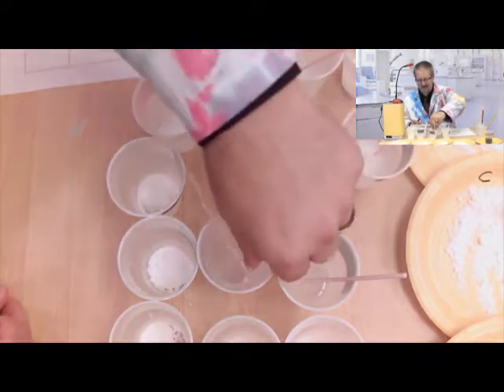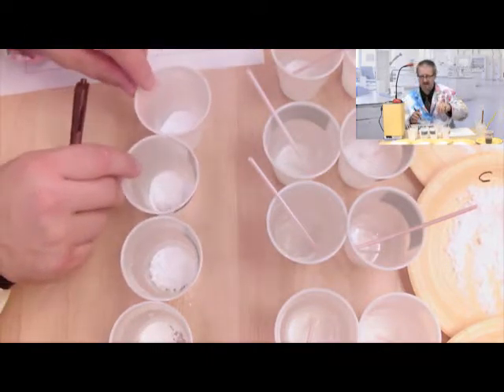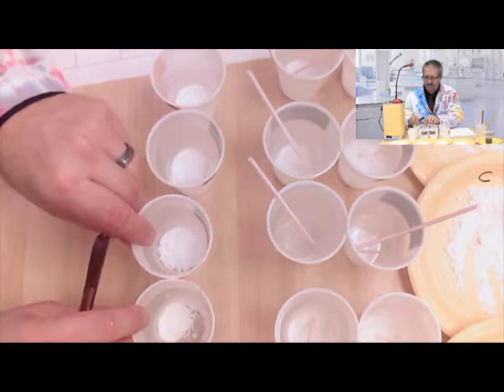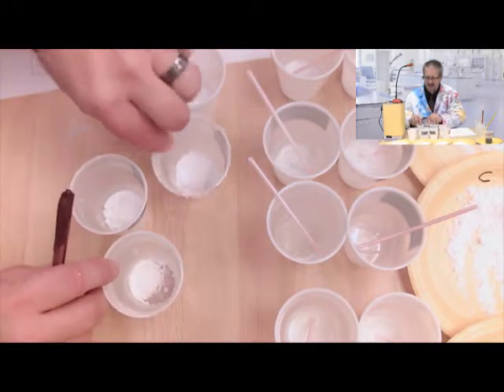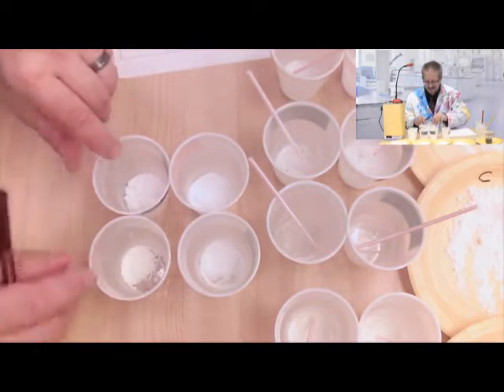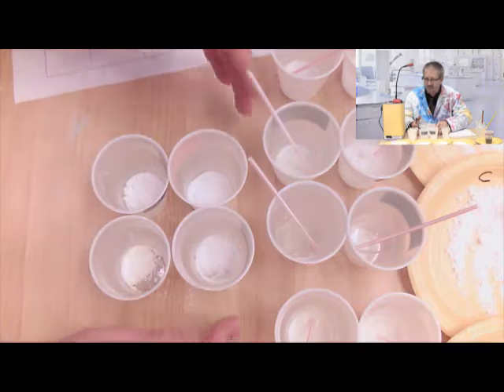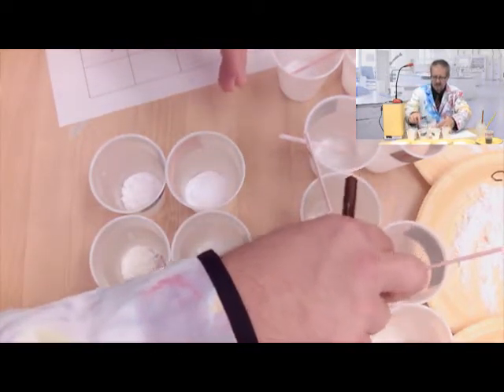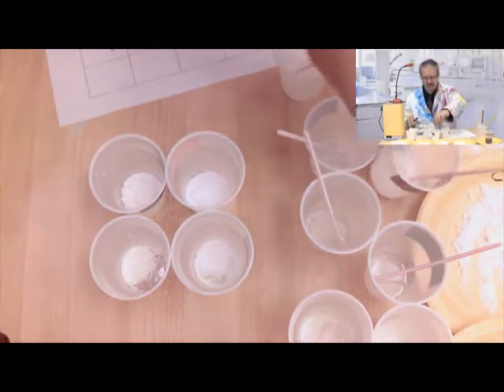We're going to move on to the iodines. Let's move these off to the side a little bit. Put these up where we can get a good look at them. Actually, maybe if we put them side by side, because we're going to put iodine on all four. Just gotta be careful.